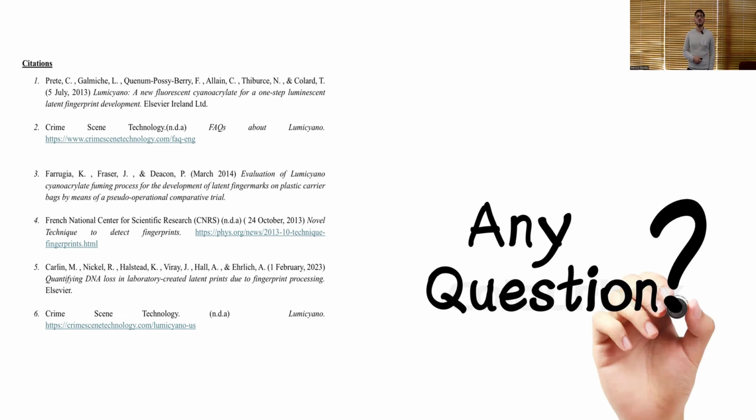And the second question was about reanalyzing evidence and the fading. That's a really important point because when cases go to court, the defense has the right to ask for a reanalysis. So they're going to be looking at evidence that may have been analyzed several years in the past, and it's usually 4 years between crime and courtroom for many cases, and sometimes longer if it's a cold case and they're developing a print. So those observations are really important in terms of how long the medium that's pulling the print up is going to last. And in terms of authenticity, it can be questioned again when you're re-examining it. That's right. Then you don't want to have to run an entire separate procedure to be able to reanalyze. That's correct, because then that will throw the original analysis into jeopardy. Exactly. Excellent.